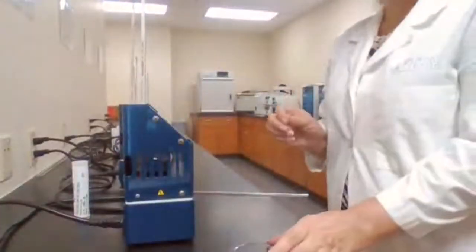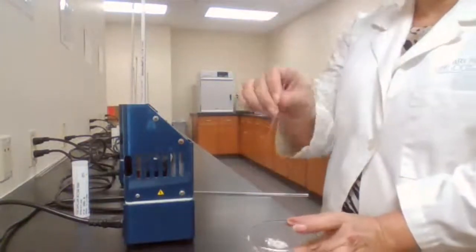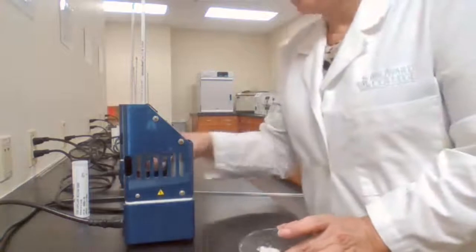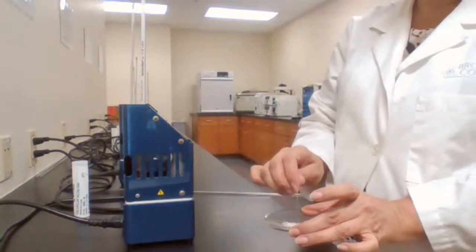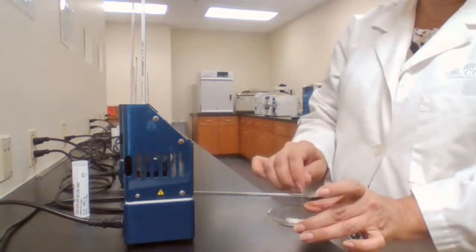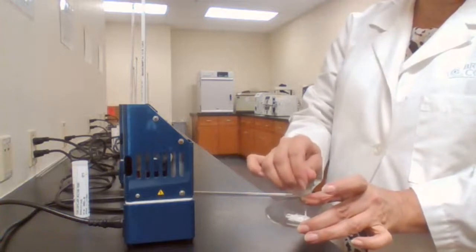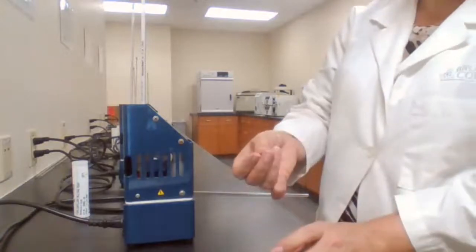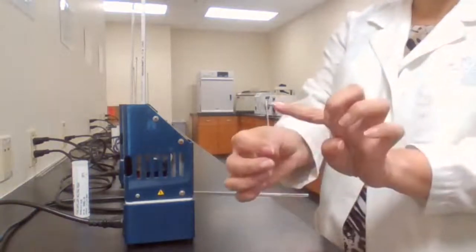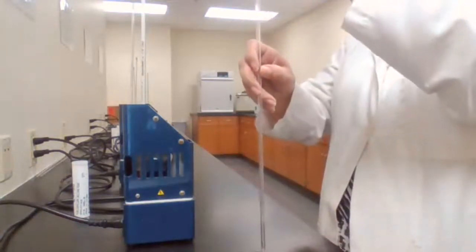I prepare the sample for you here. Same as last time that we measured the melting point. We have the sample, take a small capillary tube and feed the sample into the capillary tube by dipping the open end of the capillary tube into the sample. Not much sample, about 2 to 3 millimeters, less than 1 centimeter, like half a centimeter.